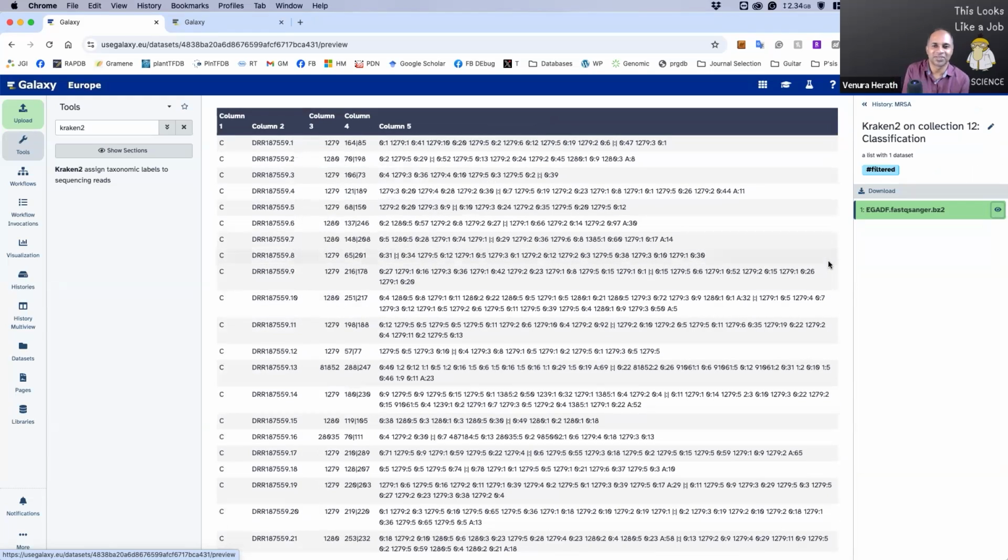Yes, a bunch of numbers, right? See whether you can find the meaning behind these numbers.